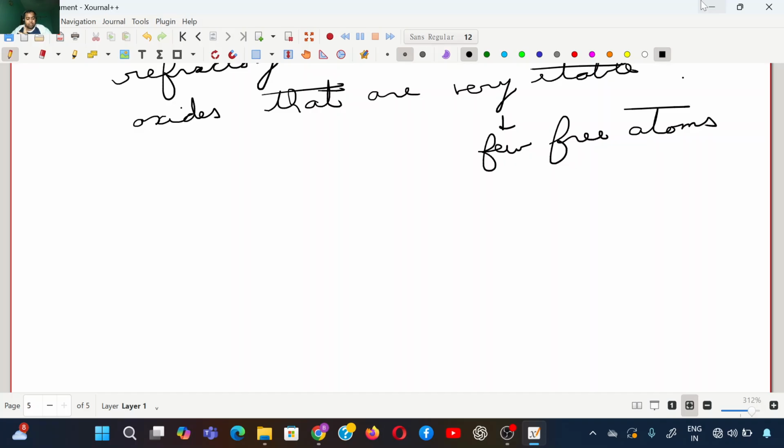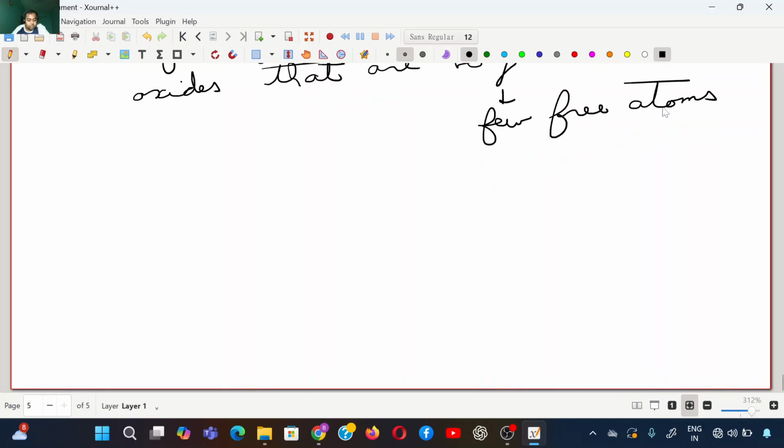Another thing I already told you in the previous class is about the flame, which has different temperature zones depending on the height above the burner. So if your sample contains sulfates, maximum absorbance occurs at higher flame height. But if it contains, say, chlorides or nitrates, maximum absorbance is seen at lower flame height. You have to be very practical in these situations. For instance, if you're analyzing sulfates, you have to raise the burner to sample higher in the flame. And for chlorides, nitrates, you have to lower the burner, right? Because maximum absorbance is seen there. That also varies as a function of height. Okay, so observation height also matters.